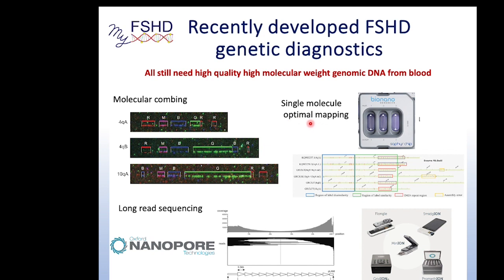But more recently, there's single molecule optical mapping, and BioNano has put this out, and this seems to be what's going more common in diagnostic labs now around the world and in the U.S. And so it's somewhat similar.